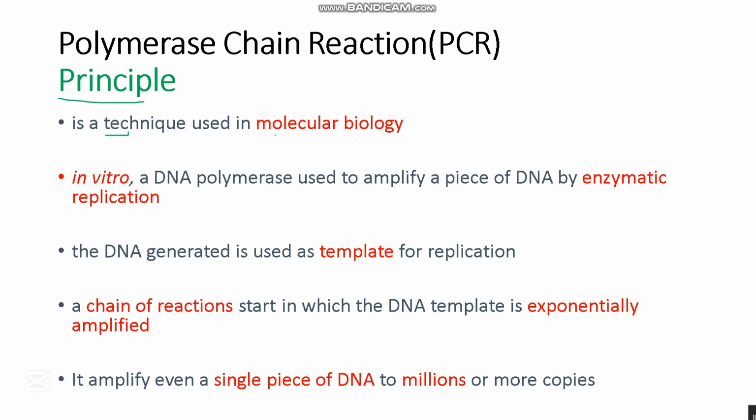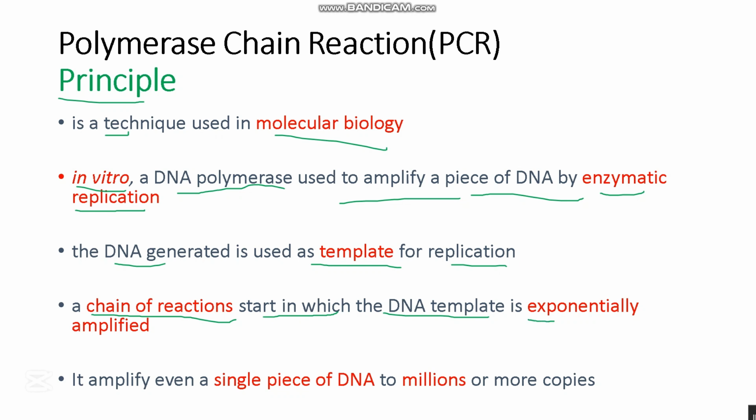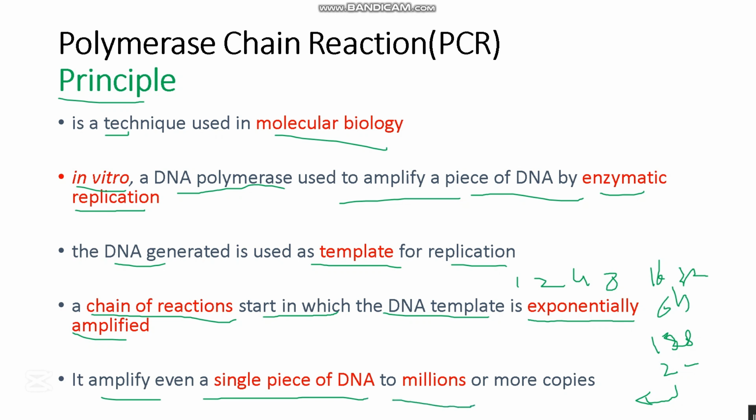It is a technique used in molecular biology, in vitro, which means in the lab. A DNA polymerase is used to amplify a piece of DNA by enzymatic replication. The DNA generated is used as a template for replication. A chain of reactions starts in which the DNA template is exponentially amplified. Exponentially means 1, 2, 4, 8, 16, 32, 64, 128, and so on. It amplifies even a single piece of DNA to millions or more copies in just 30 to 35 cycles.